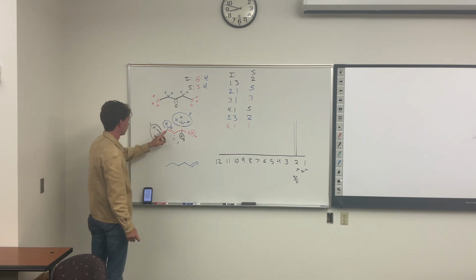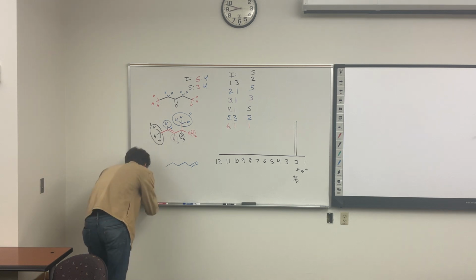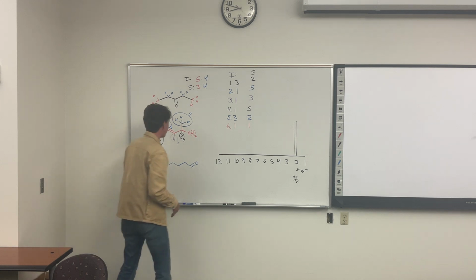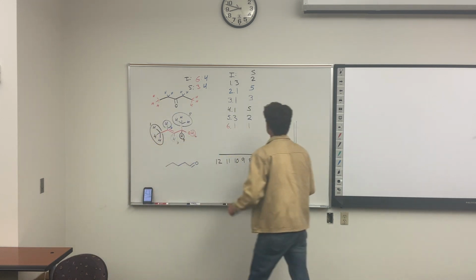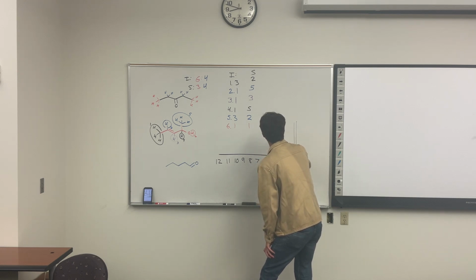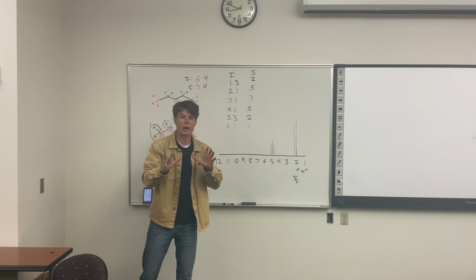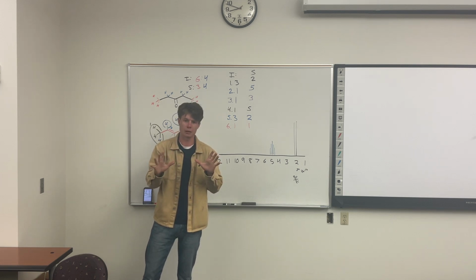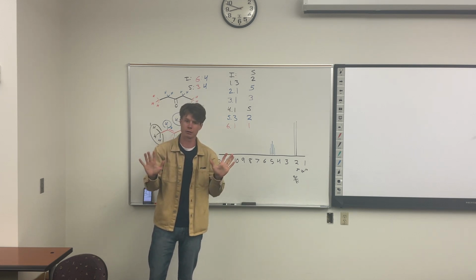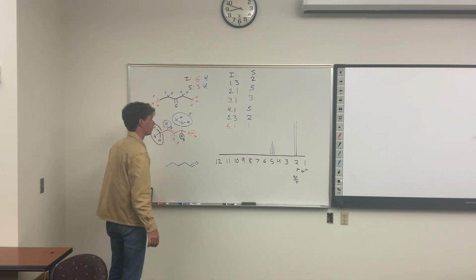Allylic hydrogen is there. Here we have a vinylic hydrogen, it's on the double bond. Those are going to be right around 5, maybe just above 5. So vinylic hydrogens, intensity of 1, split into 5, so about a third as tall, 5 signals like that. There we go. This is overkill, big time, for the ACS. But you got this, you'll be fine on the test, okay? Overkill to an extreme, but it's good practice.